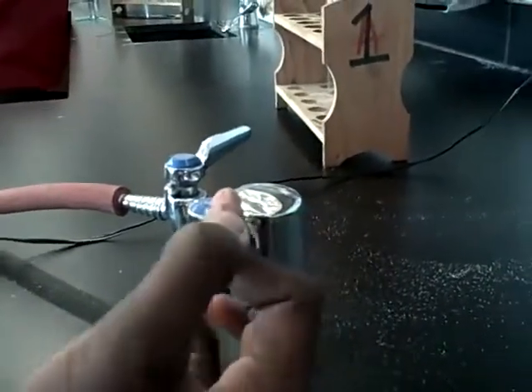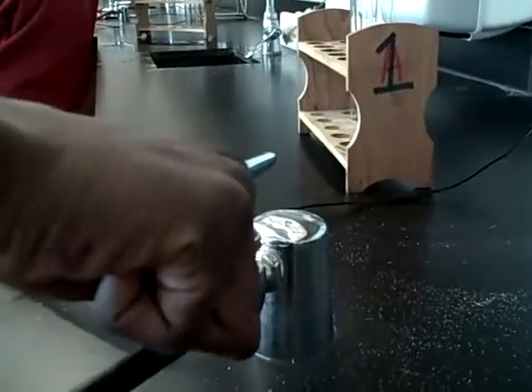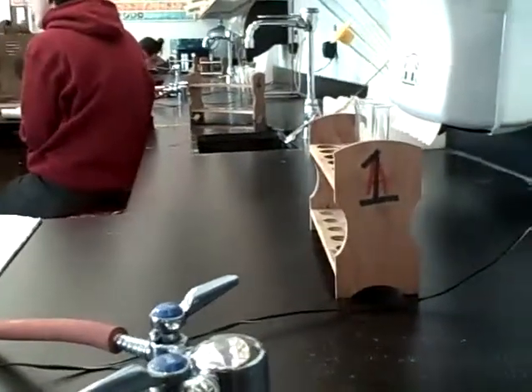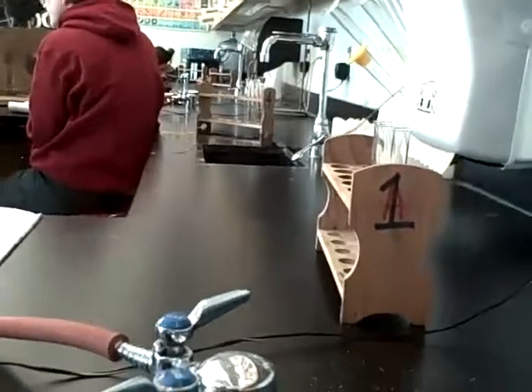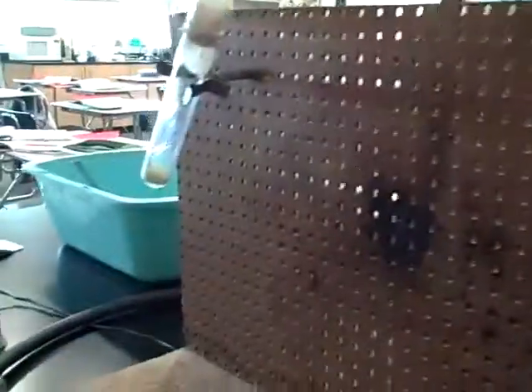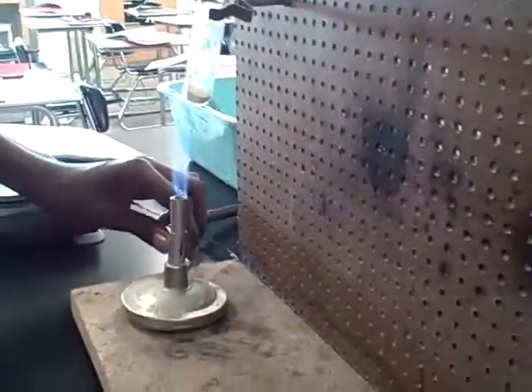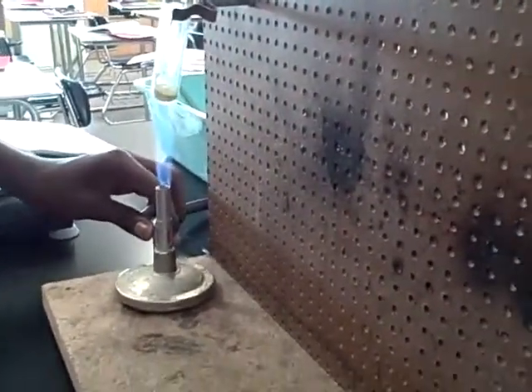We're turning the gas on parallel with the nozzle, then we're going over to the igniter and we're gonna spark it — and there's your fire. Then we're gonna move it over and watch it for a little bit.